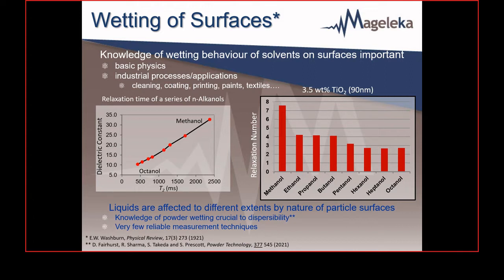Contact angle measurements are only useful for flat, planar surfaces. Interfacial tension measurements of liquids are generally only applicable to liquids themselves. Although you can use techniques such as heat of immersion, these are expensive, experimentally complex, and require a long measurement time, characteristics that make them unsuitable for quick routine laboratory analysis.